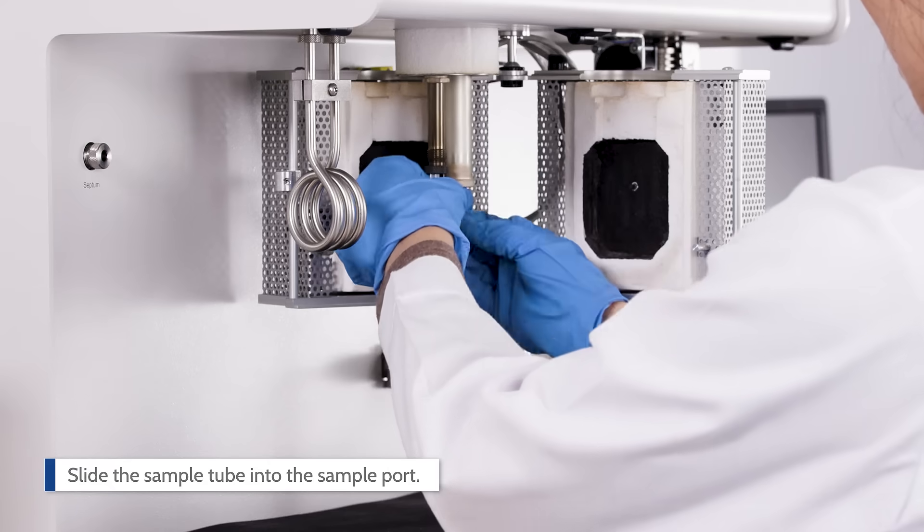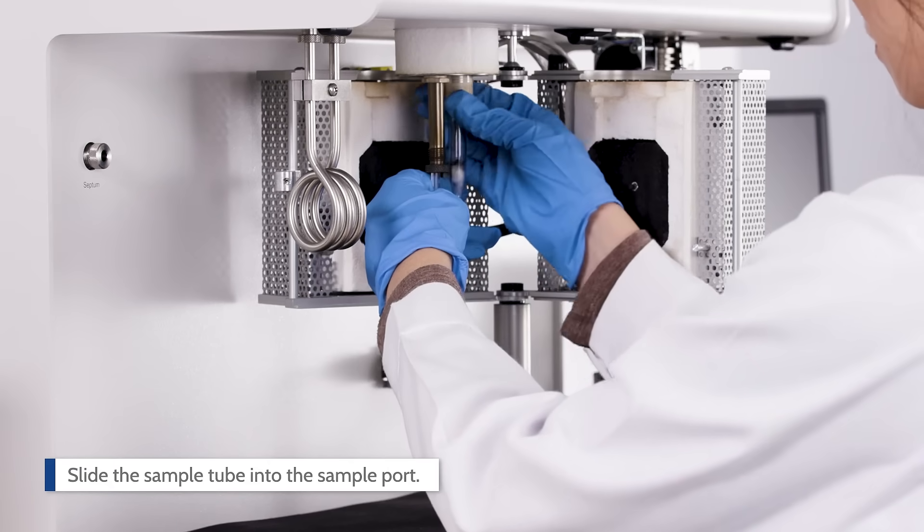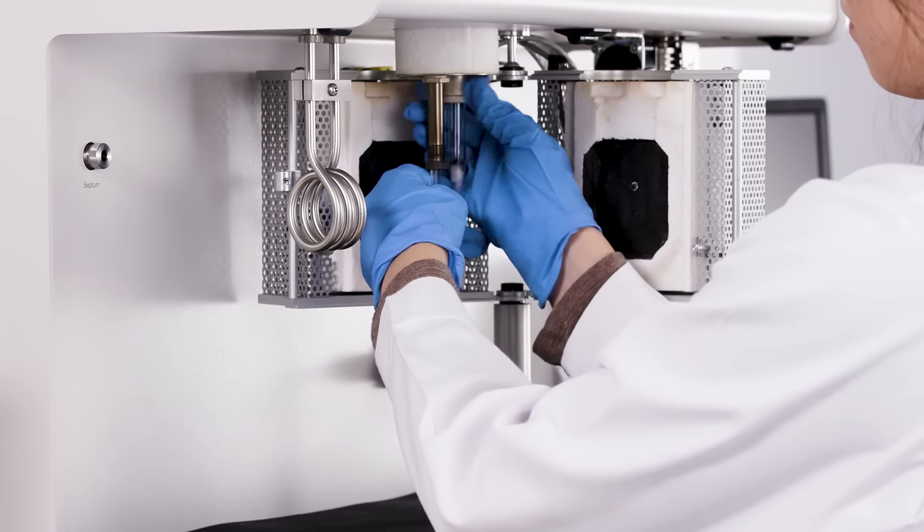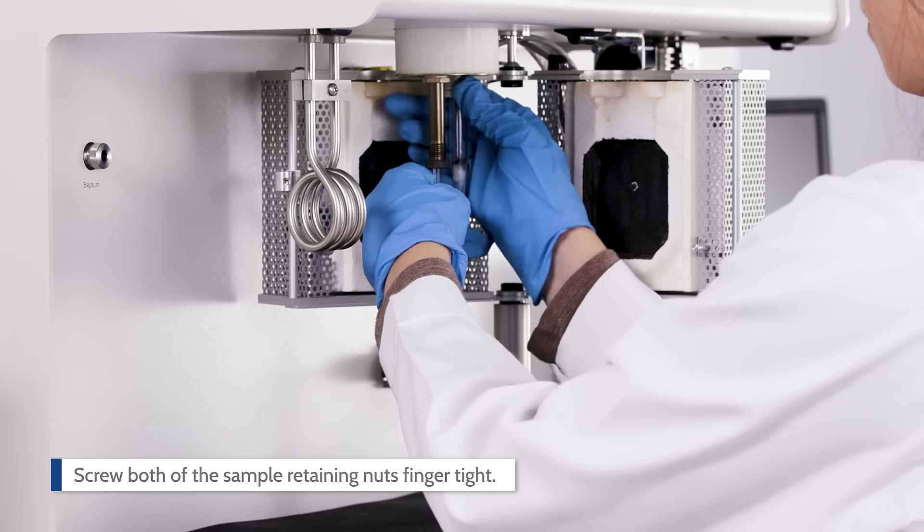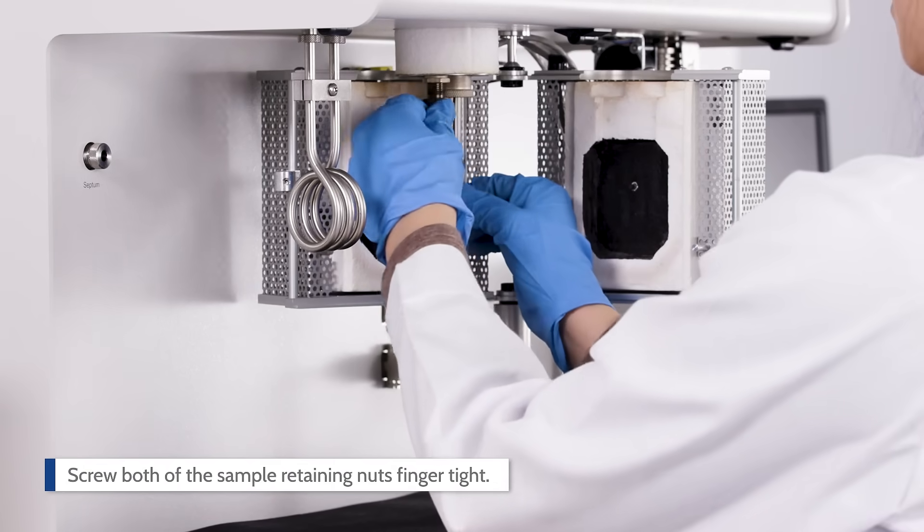Slide the sample tube into the sample port until it comes to a stop. The thermocouple should sit inside of the inlet of the tube. Screw both of the sample retaining nuts until they are finger tight.